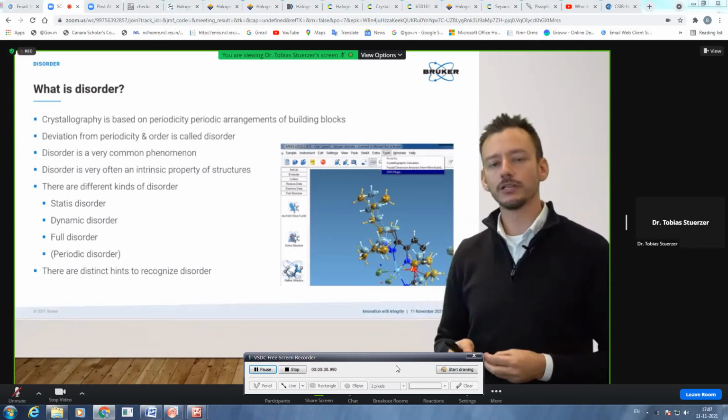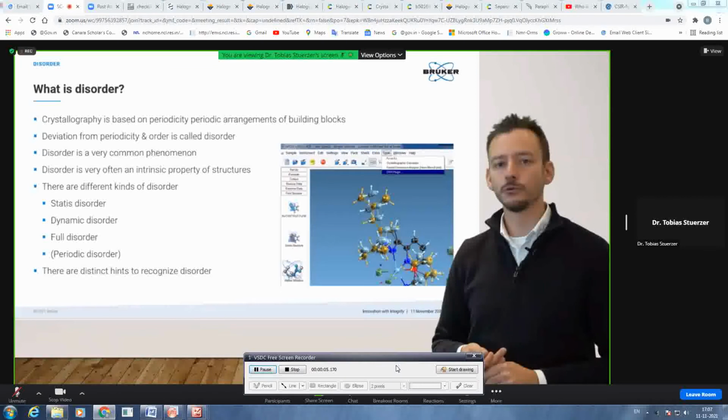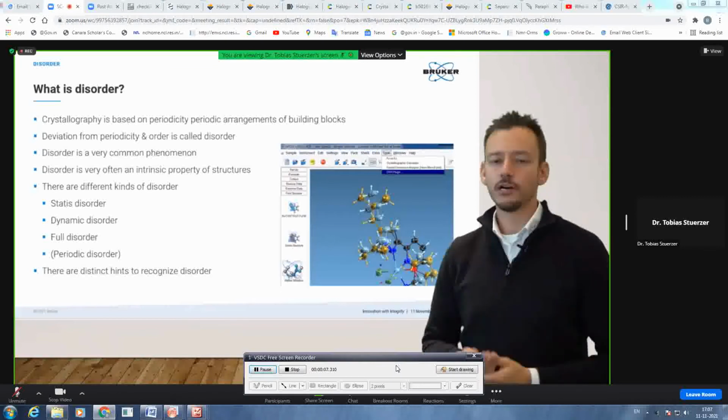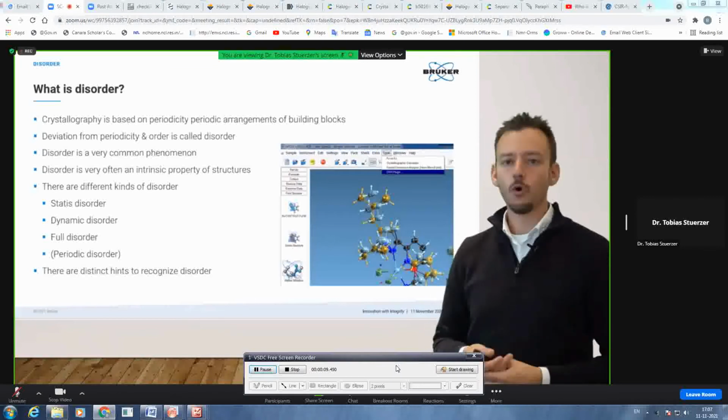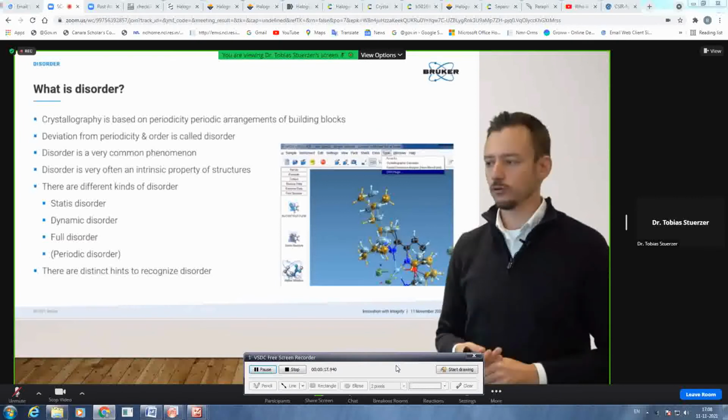And I think we uploaded quite some nice examples, and I will go through 3 of them today, showing you the tool. And I really want to encourage you to follow what I'm doing, or do it later yourself. As said, we record this, we will upload this at some point, and then you can also have a look at the recordings or ask us again.